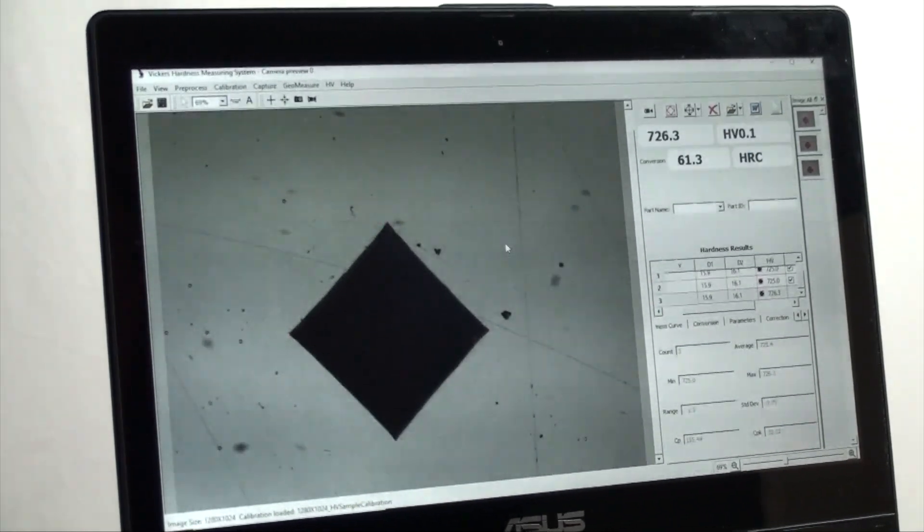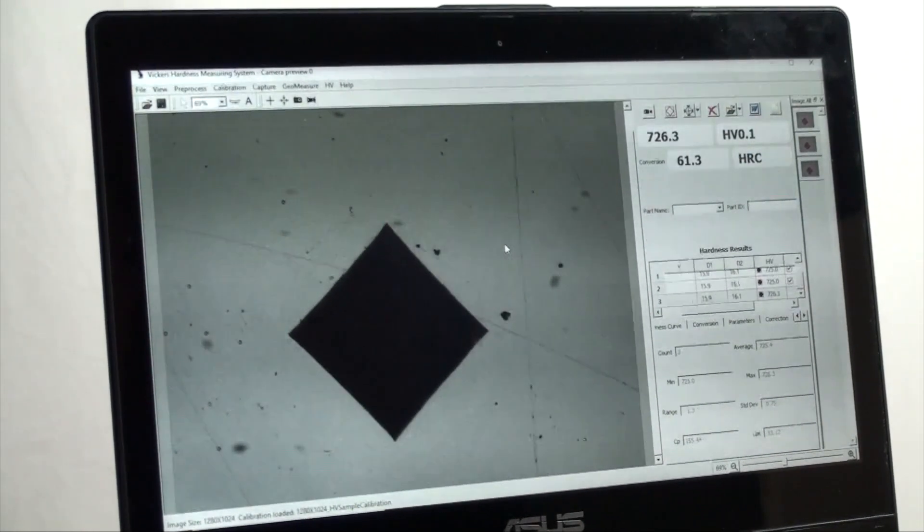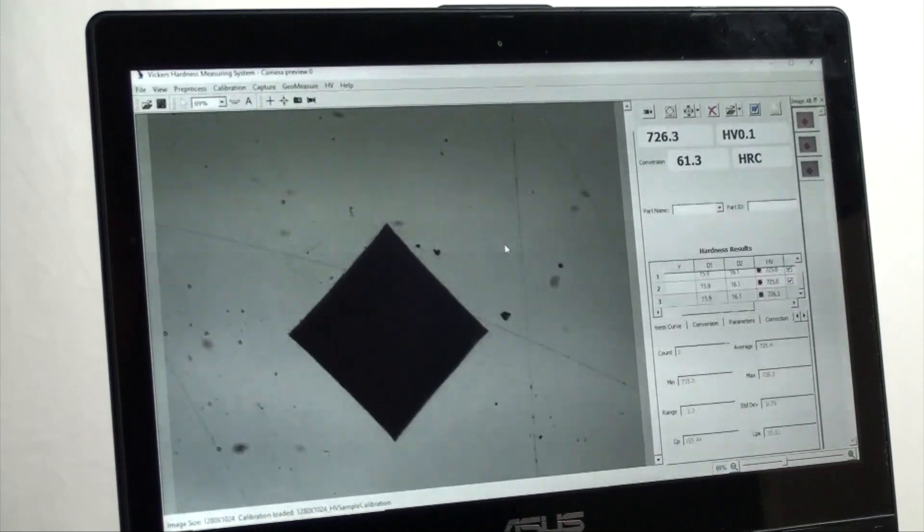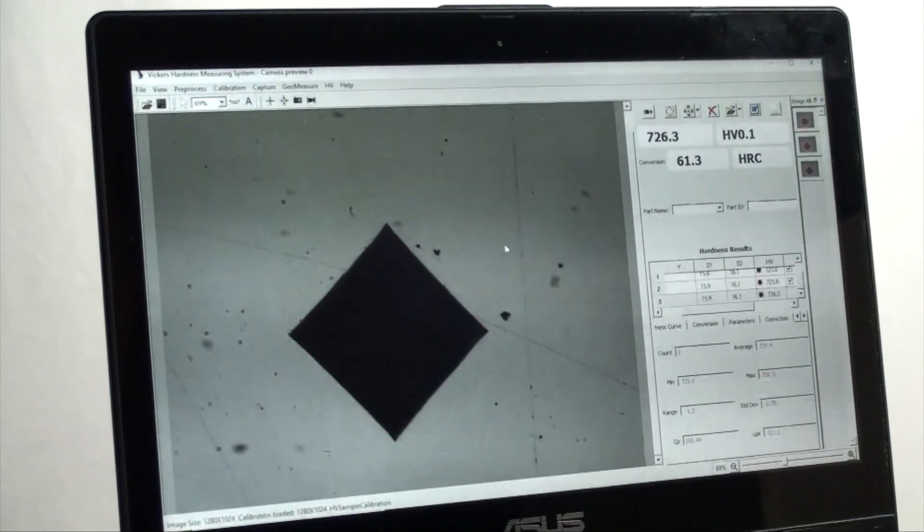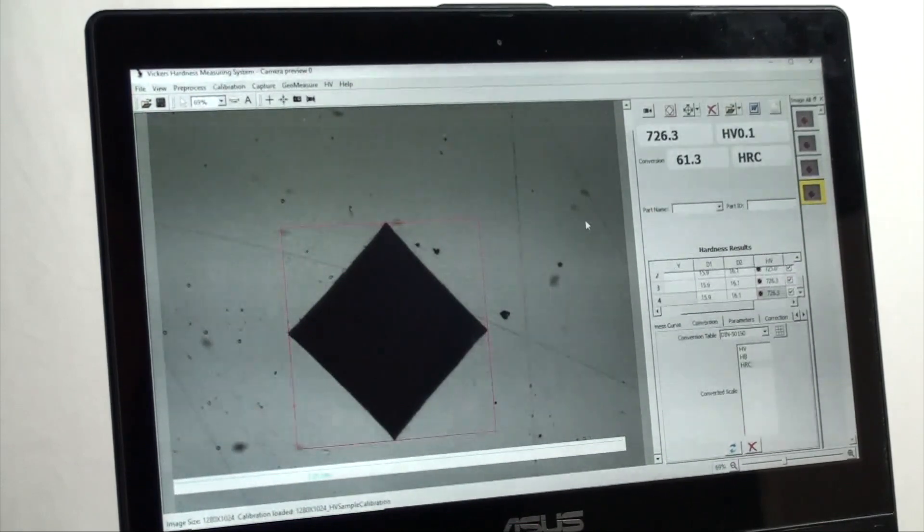Once your test is completed you can move the position of the workpiece to find another position to take another test. But let's review more of the digital interface.